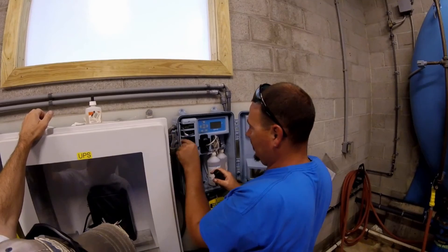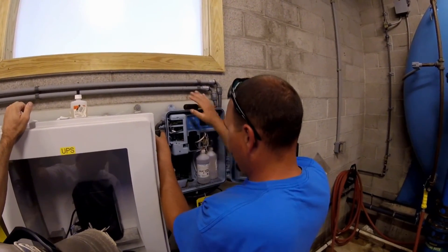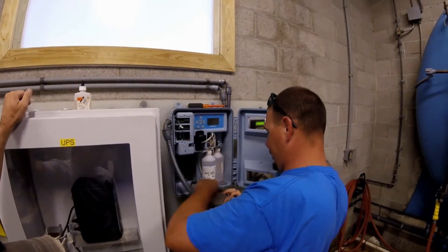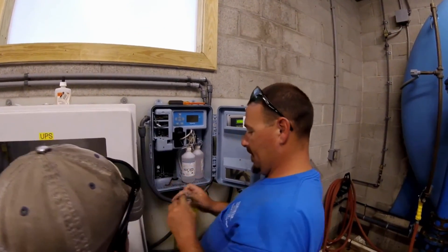Step one in any job is to make sure that the power is off to the unit that you're working on. Once that is accomplished, you can disconnect your power wires as well as your signal wires and commence with removing the entire unit, like such.